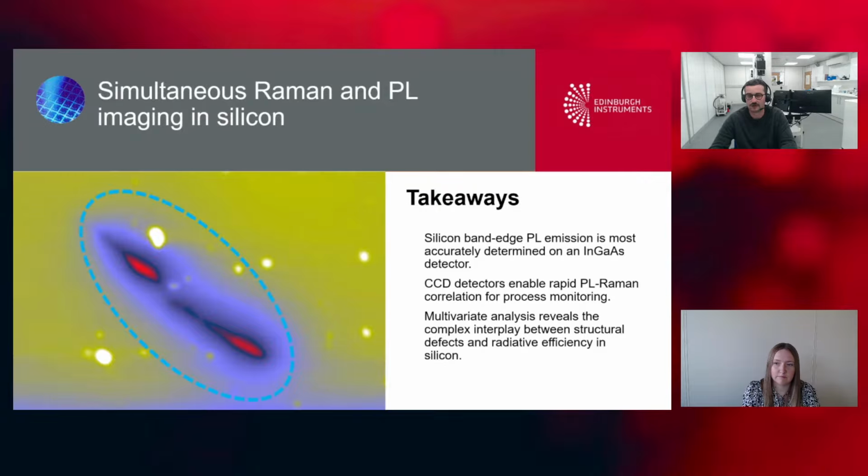The literature has several linear algebra techniques where you can take the shift in the Raman peak position and turn it into, say you were looking at aluminium gallium nitride, you want to know how much aluminium's doped within the material. You can work that out using the change in the Raman peak position. Same with strain, it can be directly correlated to the GPa being applied to the sample. If you're looking at something like carbon nanotubes and want to know the diameter of your nanotubes, you can get that as an output, basically straight from the Raman data. So that's what I meant.